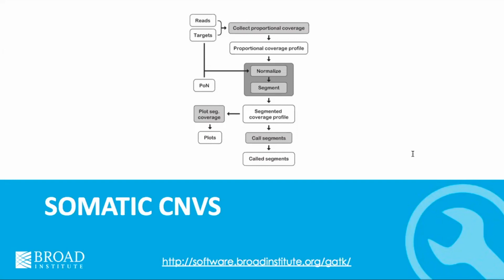What you get out of it for germline calling, and we'll go into a bit more detail in the next talk, is that you're taking advantage of the fact that most germline variants are present in more than one person. And so when you're calling variants that are present in more than one sample, you get some confidence boost, some additional evidence that allows you to make the call with more robustness. That's one of the key things that we take advantage of in germline joint calling.